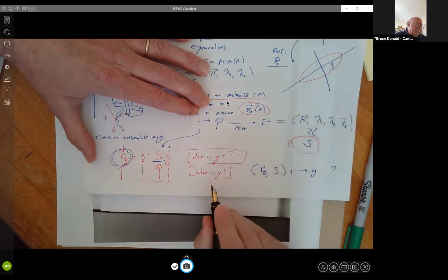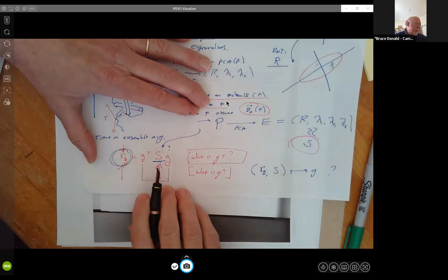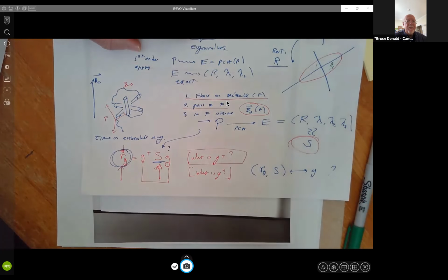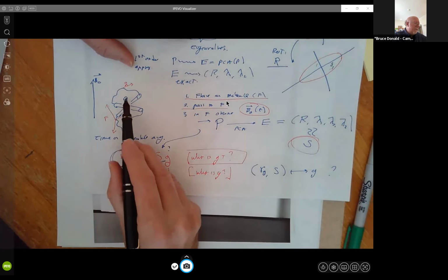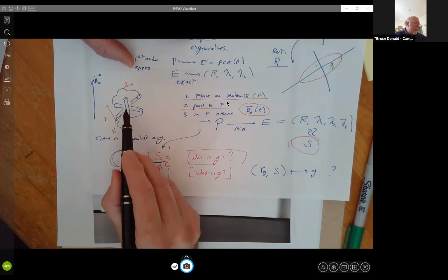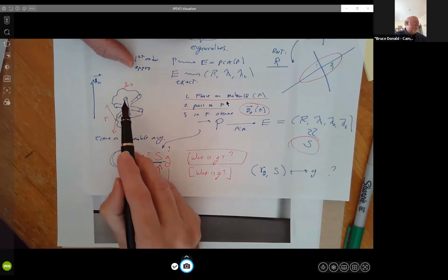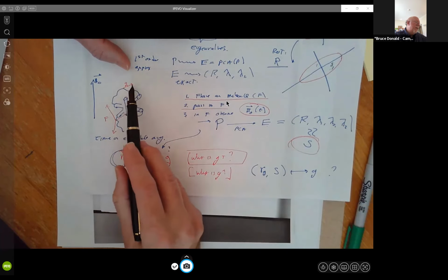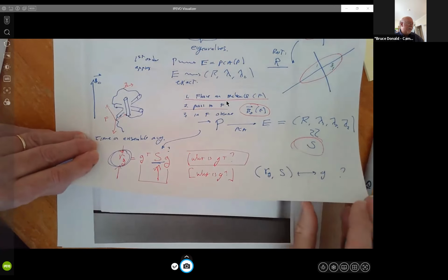Remember what we did before is we estimated S, now we're going not the other way, but we're using that information. So the beautiful thing about this is it works because we're in a global coordinate system, that even though I might have estimated the alignment tensor for this helix very far from where vector G is, this bond vector, I can use the alignment tensor determined on this helix, which might be physically far away, to estimate or compute things about the orientation of G. So that's what I want to show you next, how this is used in a system.